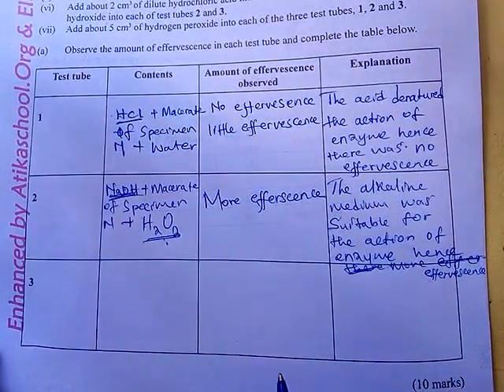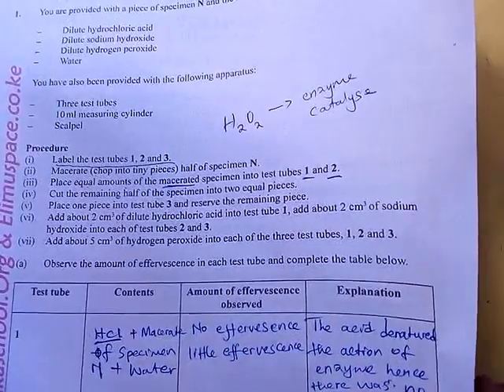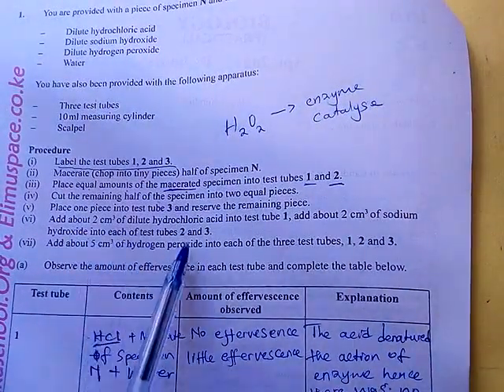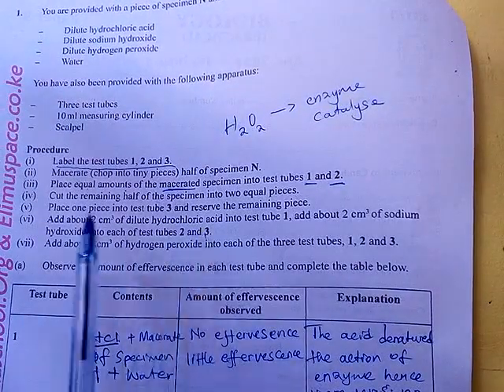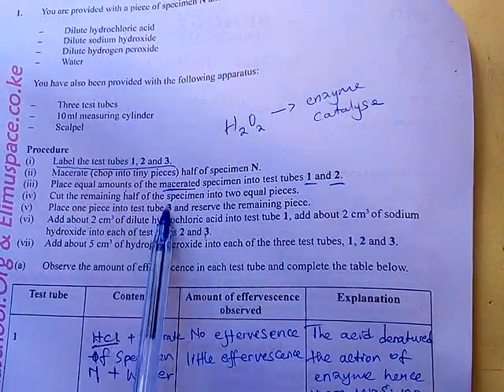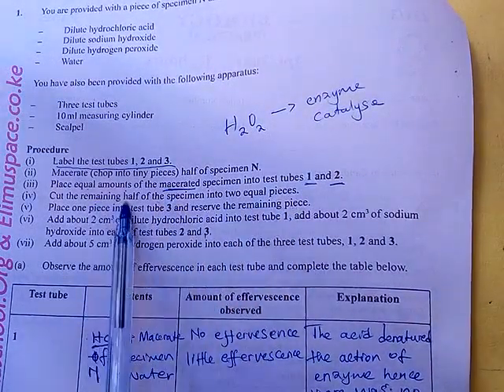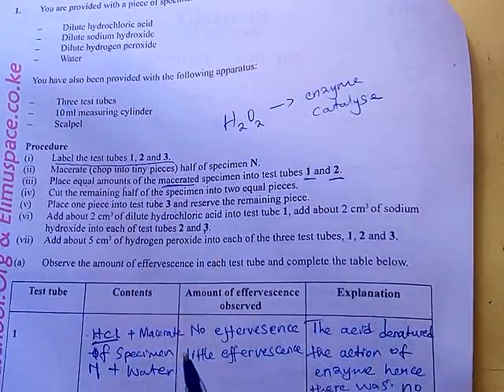In test tube 3 you are told you add sodium hydroxide and then place one piece in the test tube and reserve the remaining piece. So the piece that you cut here you are placing in test tube 3.